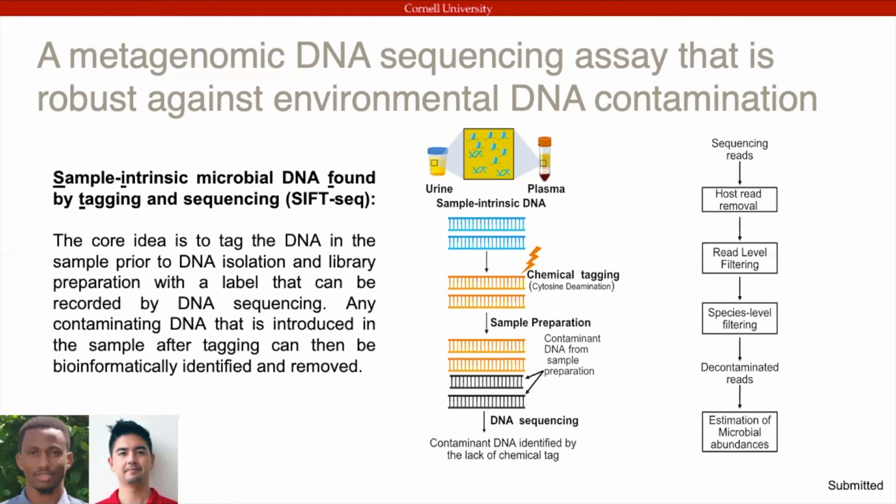Yeah, we have started looking into a few other ones, such as tagging with biotin beads. One major thing that we've done in this is we're actually tagging directly in urine and plasma, which is surprisingly difficult. For example, in plasma, there's a lot of proteins and other things that will coagulate and make it difficult to target the DNA. But we are looking into different ways in which we're not modifying the DNA, because while bisulfite conversion does allow us to perform methylation profiling, it significantly reduces the search space because now we only have 3 nucleotides that we can use instead of 4.